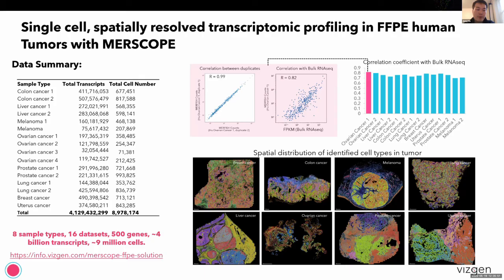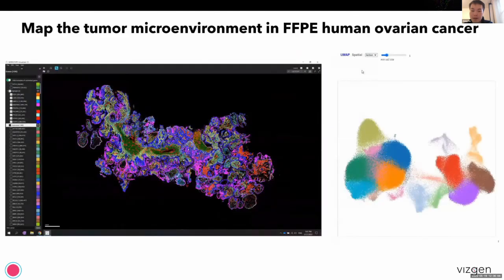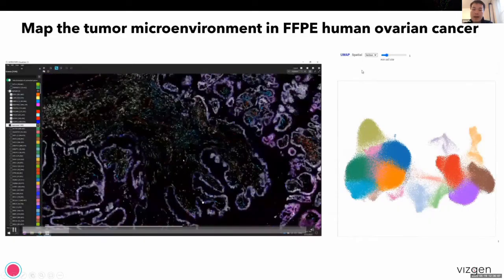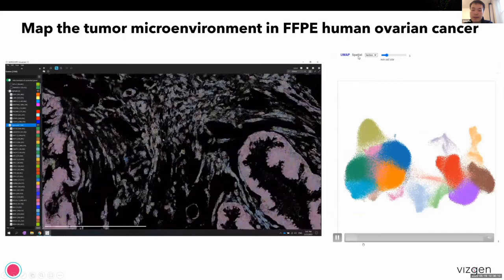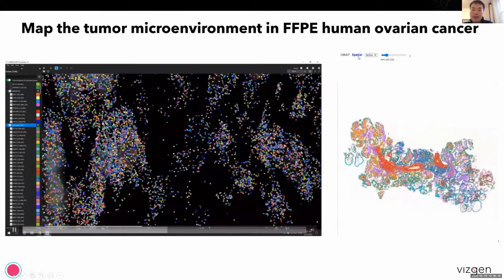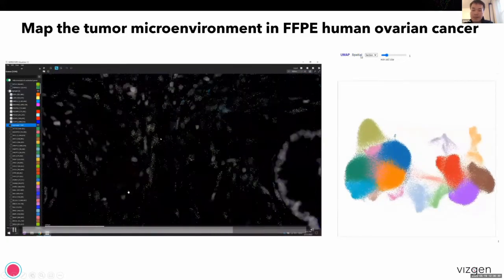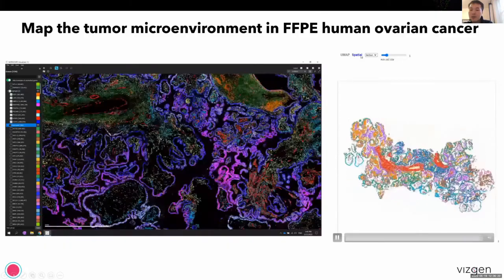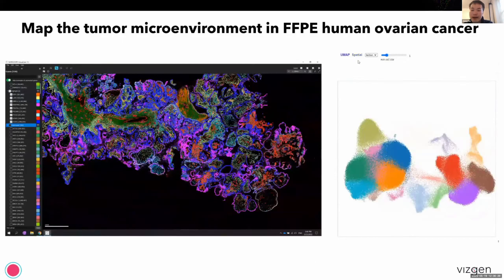In the last few minutes, I wanted to quickly highlight what the data looks like. Here is an ovarian cancer section — a video showing real data with 500 genes of single-cell measurements, projecting the transcripts in space with a UMAP and spatial distribution of cells in space, highlighting the power of cell atlas in ovarian cancer.